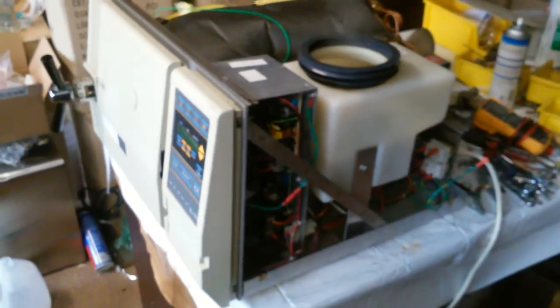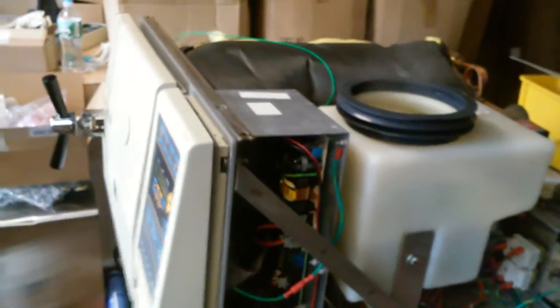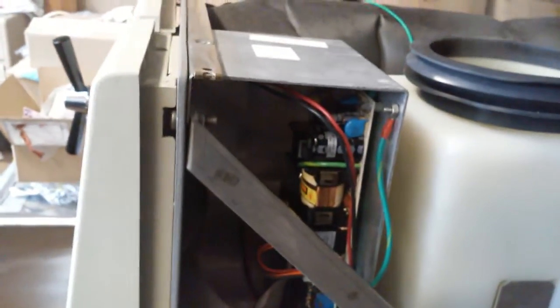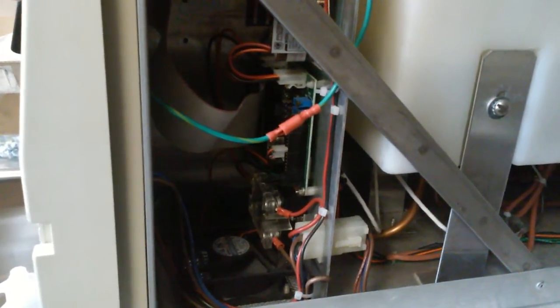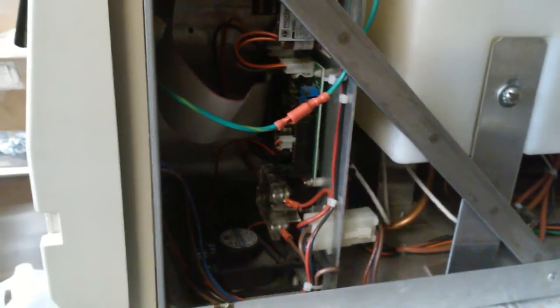All three types of sterilizers have a very similar inside — almost the same. On the top, all the circuit boards are inside this box. The top one is the power supply. Underneath that is the adjunct board. They have adjunct 2 and adjunct 3 boards, depending on whether it's before or after the year 1997.